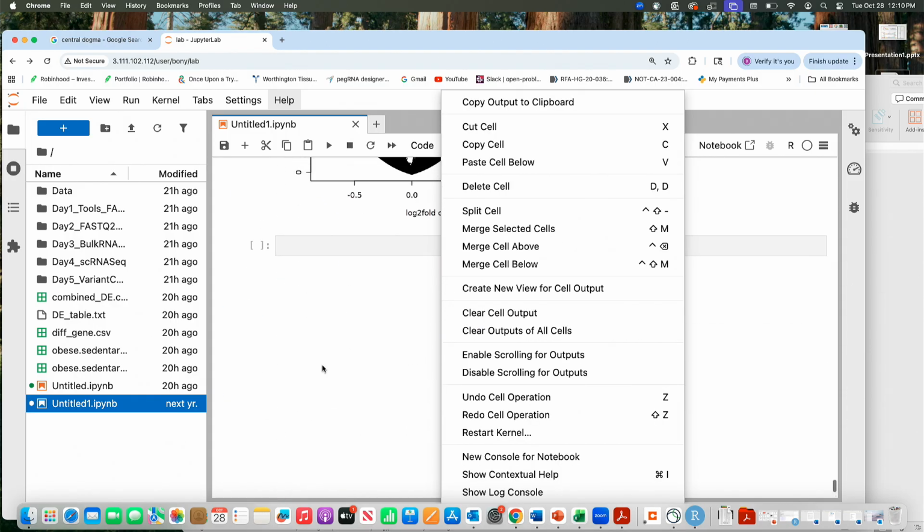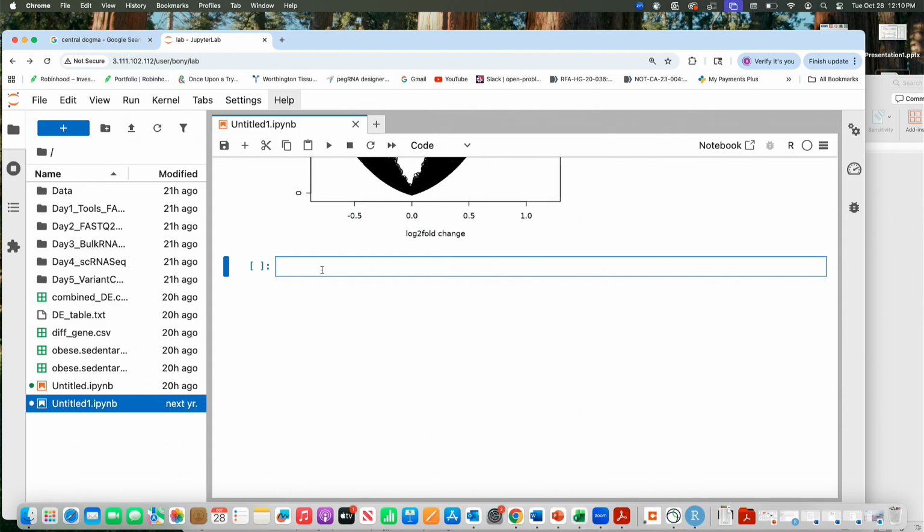You don't know what a function does, right? Francis, one thing I want you to show, I don't know how to do that: you make a plot, and how do you download the plot in Jupyter Notebook? Just show them that. Okay, just one thing I forgot. No, but they're going to do it all the time tomorrow, or this afternoon. Oh, downloading that. Yeah, okay. So, the plot that you made, how to download it from the Jupyter Notebook.